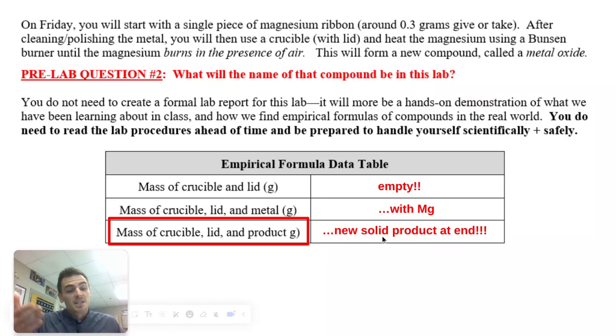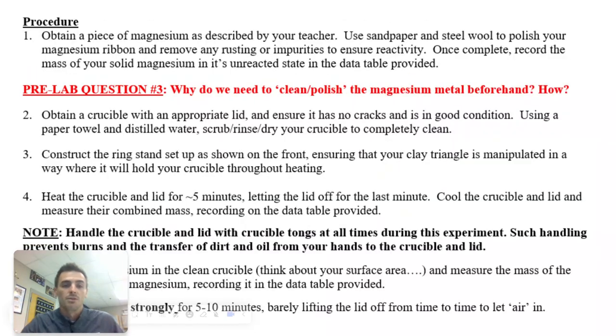That's one of those pieces of evidence that we've had a chemical change and a chemical reaction occur, and we've truly made something new. So when you go to do that, it'll be really, really important you know when it's done, and we'll talk about that in a minute. But otherwise, little pieces of information.